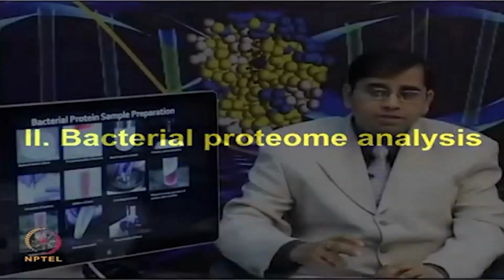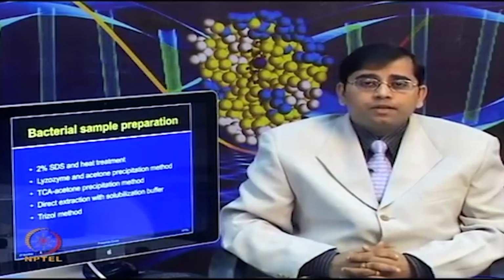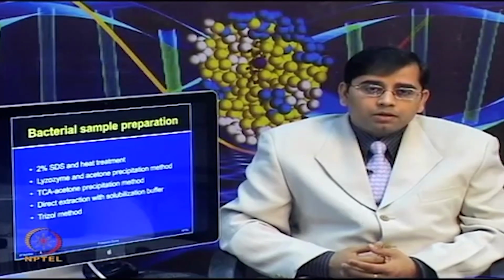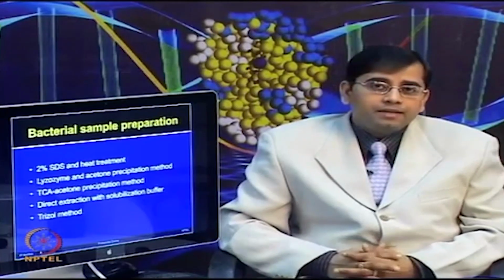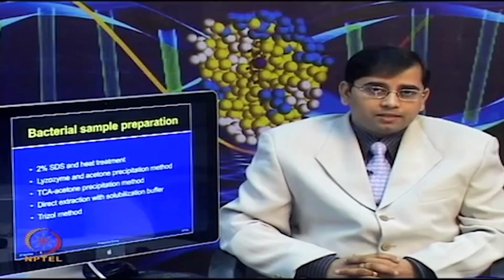If you remember, in the last lecture I stopped on the slide where I showed you various steps which are involved in bacterial protein sample preparation. So, now let us elaborate on this and continue with different types of sample preparation strategies which people apply for bacterial protein extraction. These are all reported methods available in the literature. I have just compiled them for your brief overview. For the detailed protocol of each, you can refer to the detailed publications.